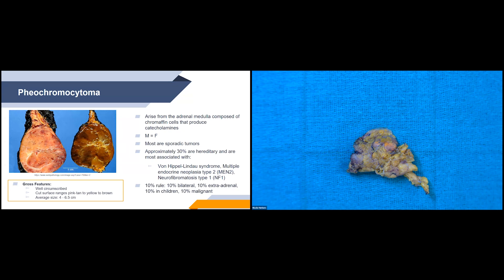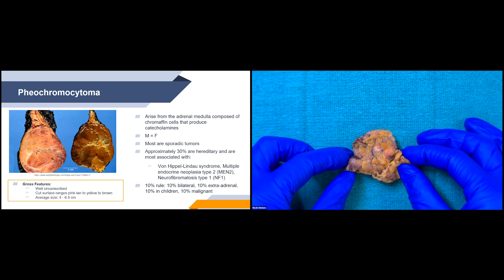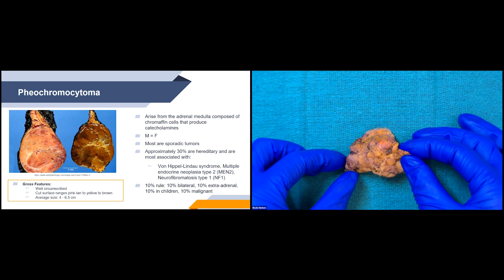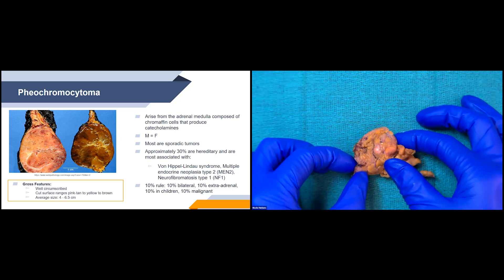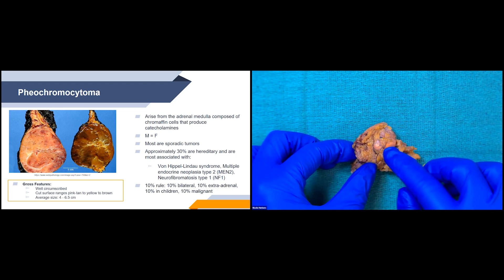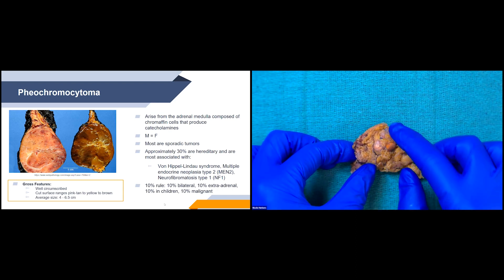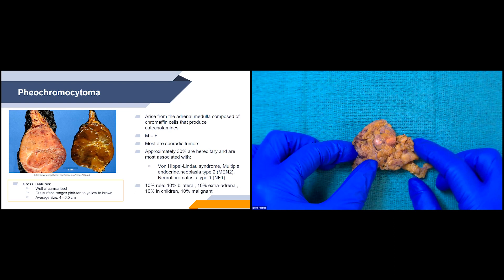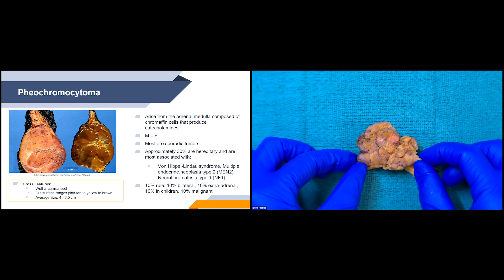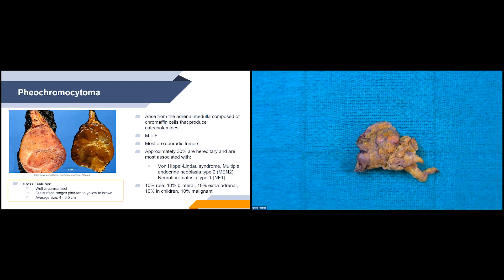Now, after going through all of those differential diagnoses, let's take a look at our specimen today. It's pretty small, and you can see there is a nodule here. Our case today is out for an adrenal cortical adenoma.